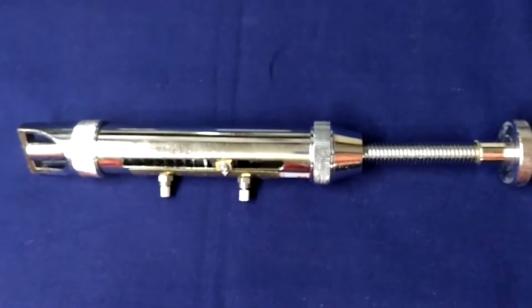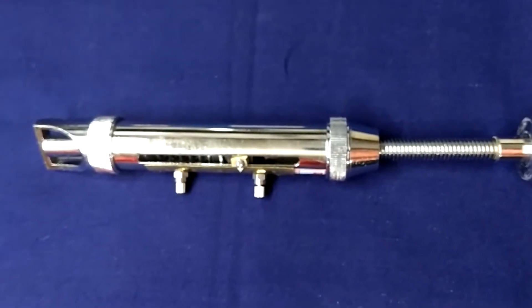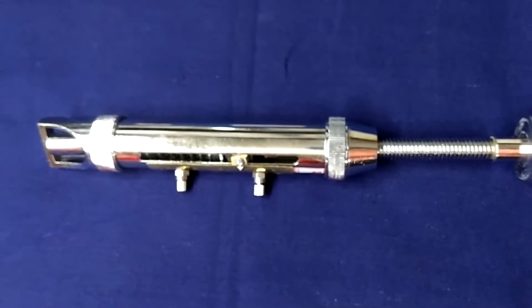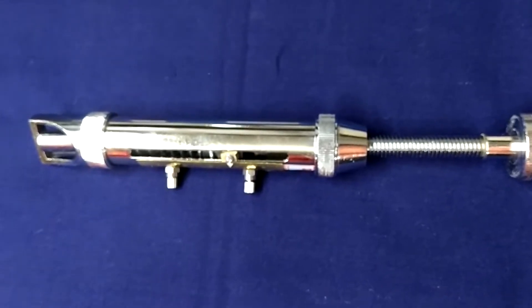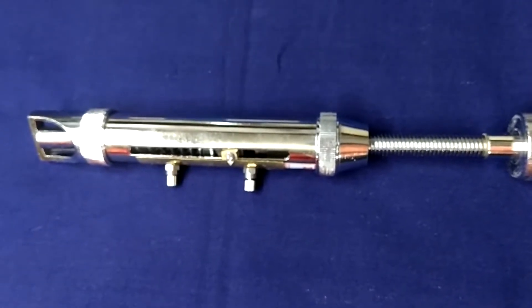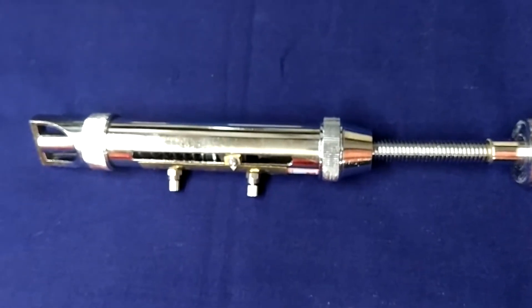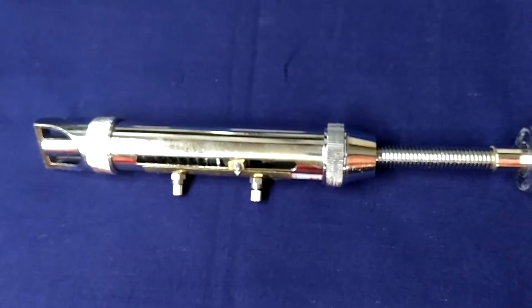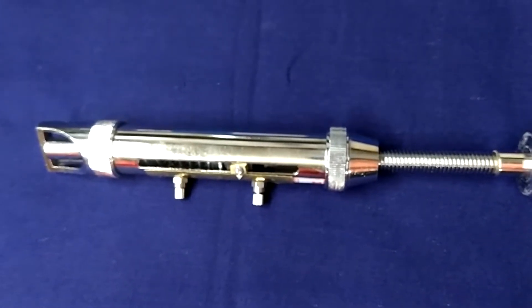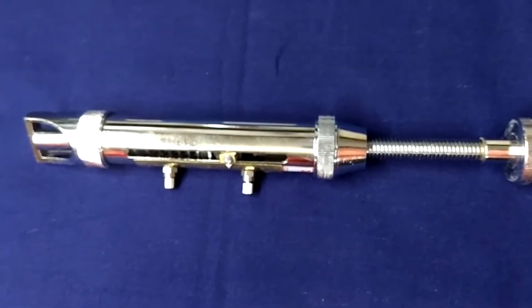This is a fairly handy instrument for taking quick readings for the hardness of tablets. It is made of brass turned parts, heavily chrome plated. The scale is 0 to 20 kg.